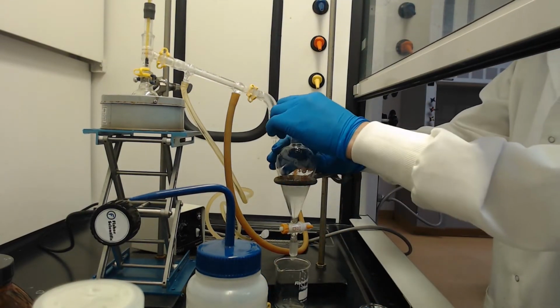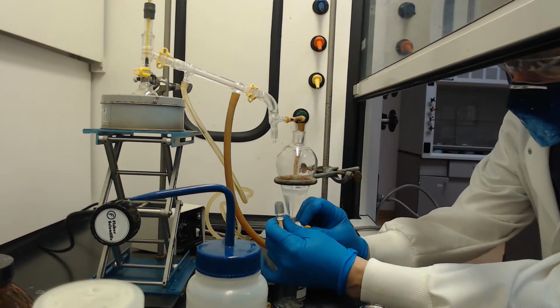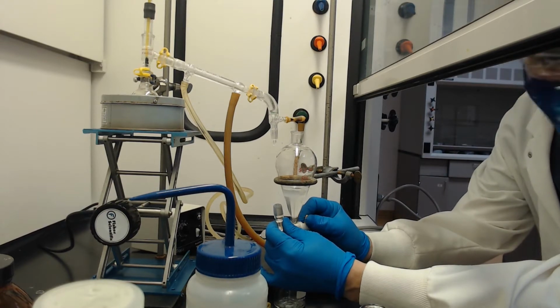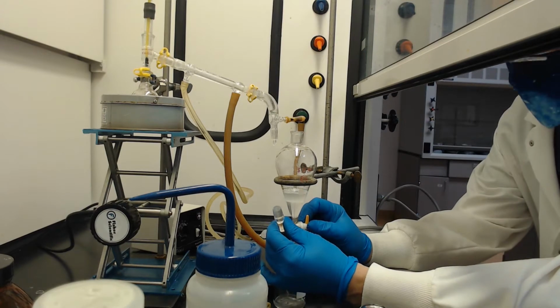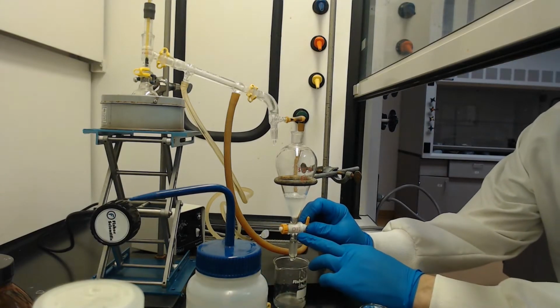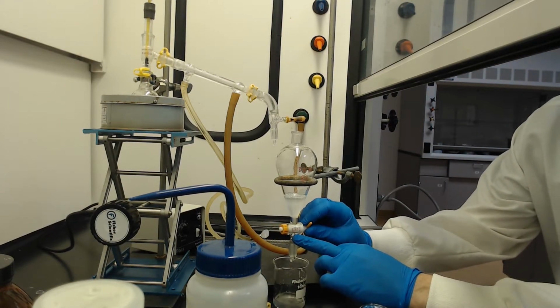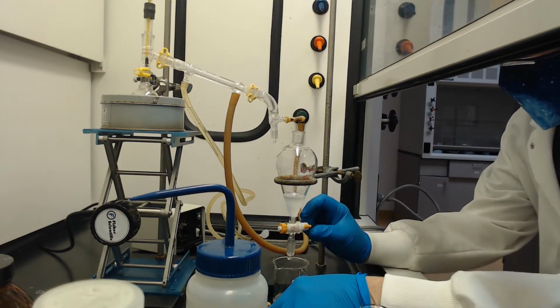Now, it says to discard these aqueous washings. I think it's always a good thing, it should say discard it after you've isolated your product. Just keep it off to the side, and when you get to your final cleanup, you never know if you got the right layer or the wrong layer. So here's the critical point as we get to the bottom of this, and I see that go down, and there it is. All right, that's the first wash with just plain water.